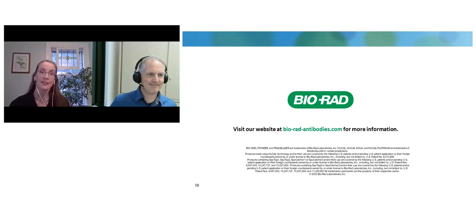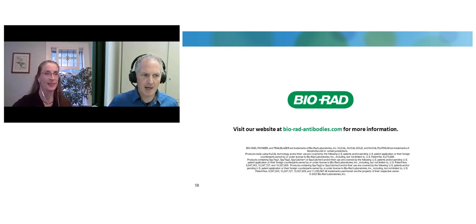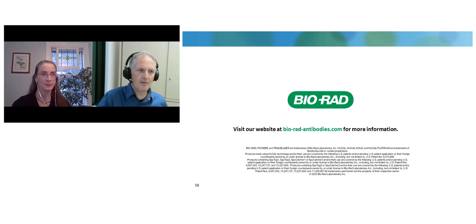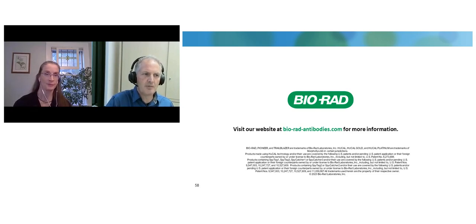First question. Nice talk. Is the SpyCatcher antibody construct expressed cytoplasmically or periplasmically? The SpyCatchers are expressed cytoplasmic in E. coli for the standard SpyCatchers. If we look at the FC catcher, then we go to mammalian expression because the FC part is glycosylated. So we want to have the FC part as it is in IgGs.